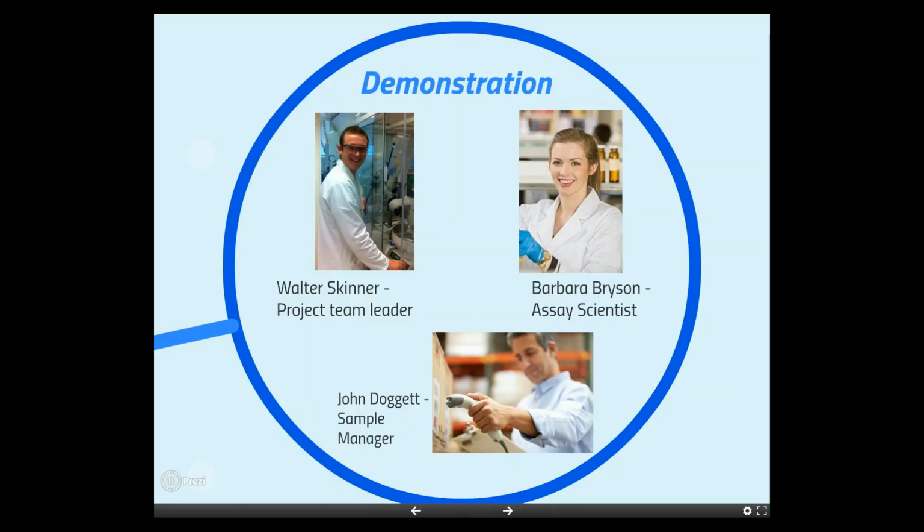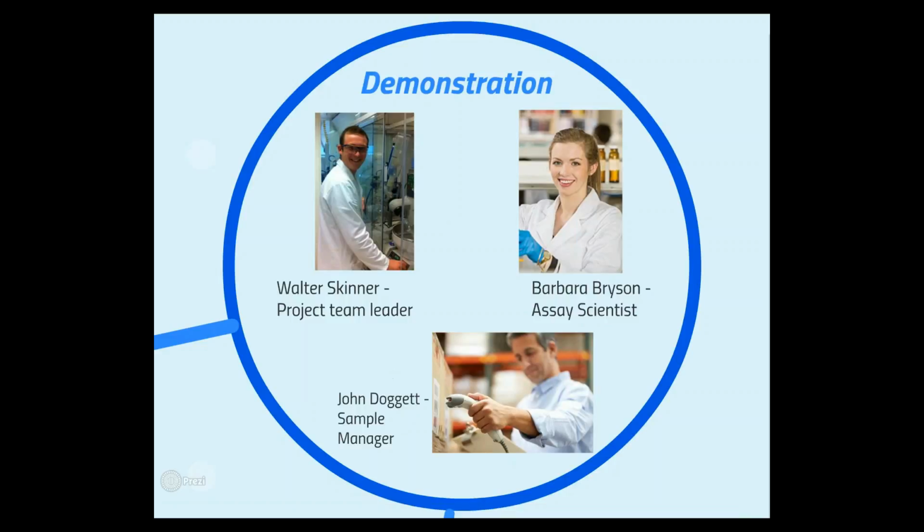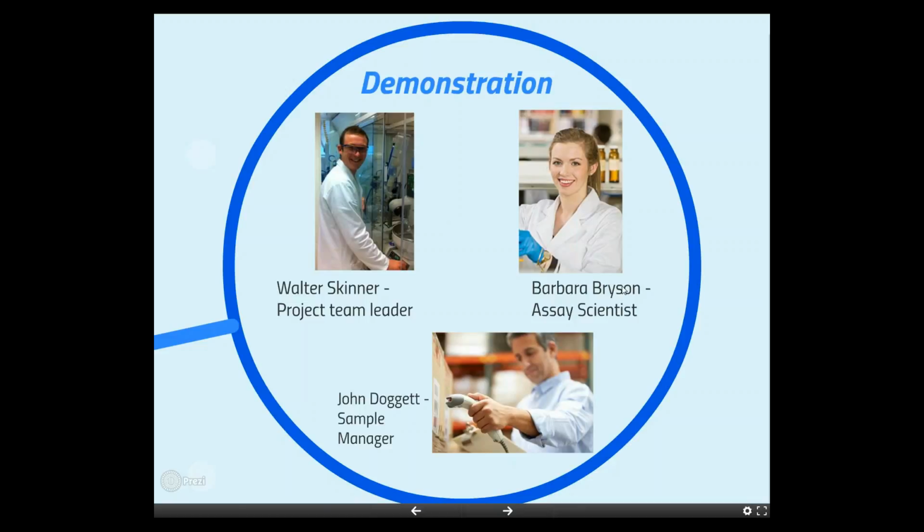and then she could submit her order for assay-ready plate again to the sample management group, so it could be processed from liquid tubes into a rack, and then finally into a fully defined assay-ready plate, shipped to Barbara, where she can place her controls and standards on it, schedule the experiment, and then run the assay itself, delivering results which can be analyzed using other parts of BioRails, and then results published back to the project team. So we've got this full workflow here. Hopefully that was reasonable to follow. I know I was jumping around a little bit, but hopefully you managed to follow the workflow.